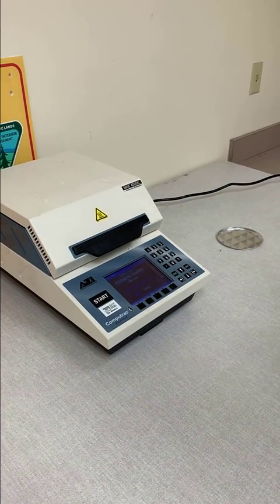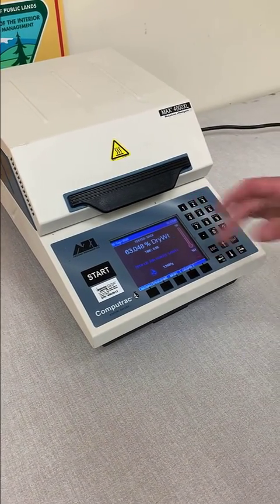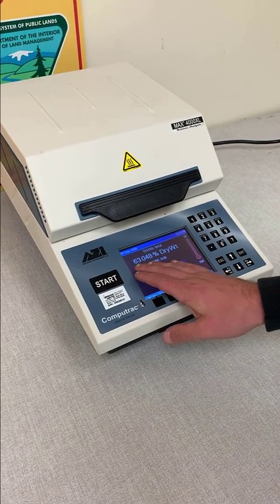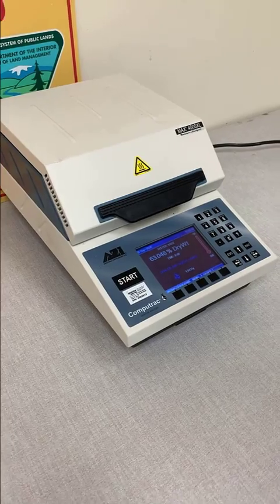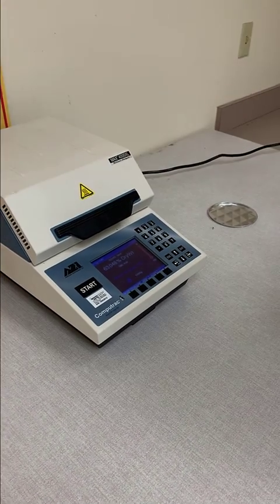Our sample has been weighed, dried, and measured. As you can see, our interface lets us know that it only took eight minutes to come out. For our live fuel moisture of this piece of sage, we are currently sitting at 63%, which we would expect having done this sample in late September — we would consider that a seasonal trend.